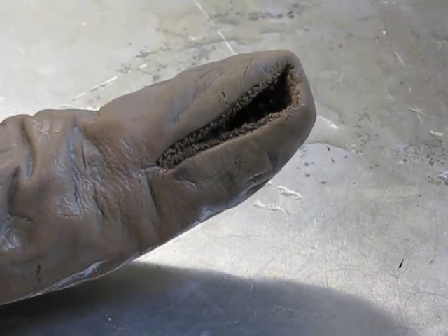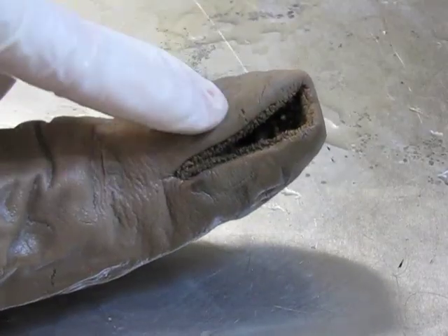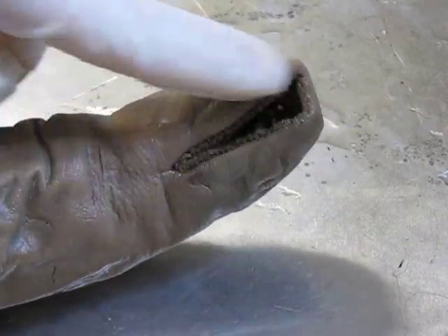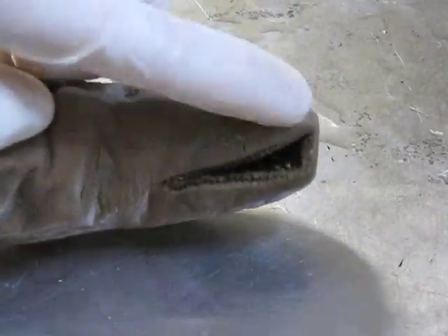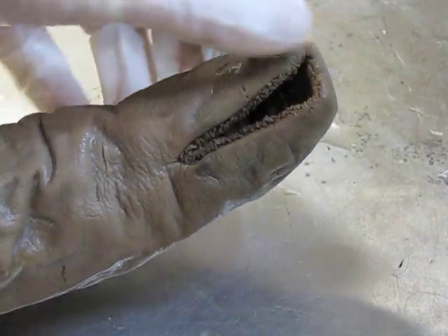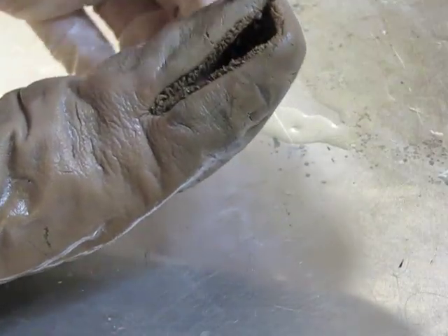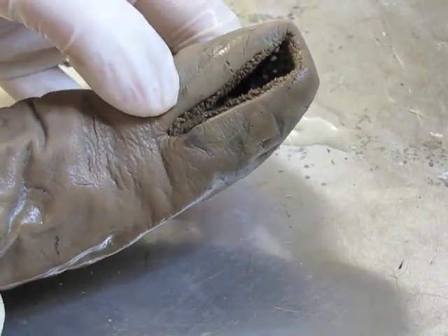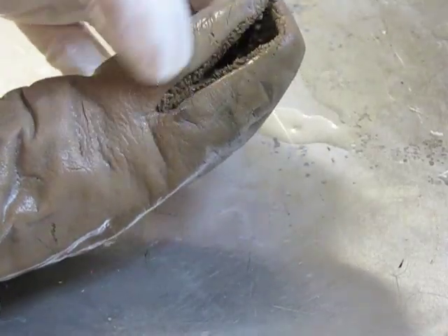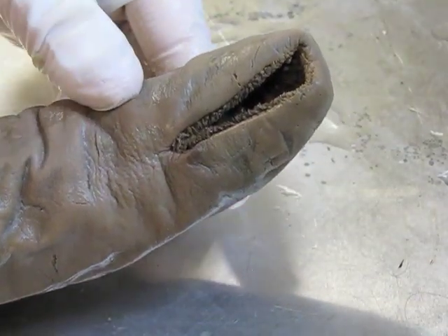Flipping the animal over to show the underside and the mouth: the mouth doesn't have a jaw — there's no real top or bottom, just an opening. The opening is lined with structures called sensory papillae, which sort of look like little tentacles. As the name implies, they are used to feel around.